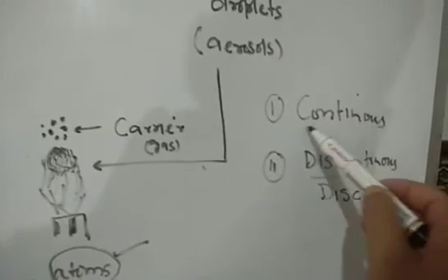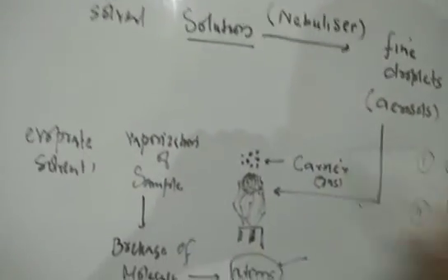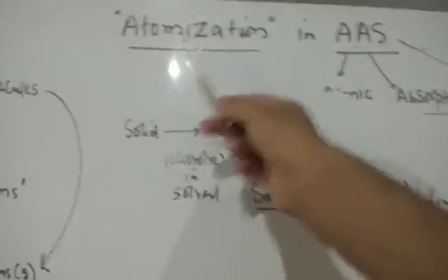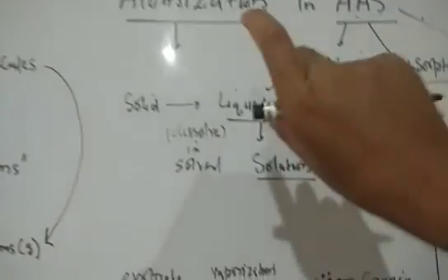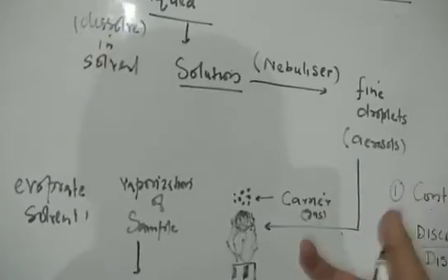During the process of analysis in the atomic absorption spectroscopy, the sample is continuously subjected to the process of atomization, and finally we are getting the atoms. That's called a continuous atomizer. अगर once at a time आपने सारा sample convert किया, this is not a continuous process. It only happens once. That it occurs in a discrete manner. It's called as a discontinuous atomization.